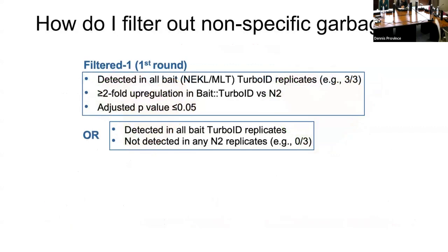Okay. So Dave, for these replicates, is this a pool of worms? Because the worm is very small, right? It's not really a single worm. The worms are pooled. We keep them in alligator pens and move them around with pitchforks. Yeah, they're minuscule. So we're talking thousands, maybe hundreds of thousands of worms present, and they're all at different stages. So again, that's casting a wide net. If there are slight differences in the stages of our populations, which of course there are, a little bit more of the little ones and a little bit fewer, that's going to affect to some extent what we get out of it. And I recognize that.